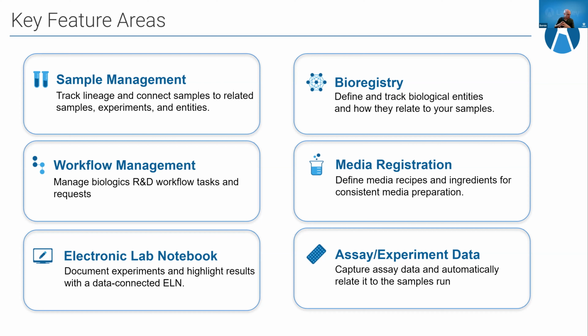I see another question here. For your more production-minded customers, does the Biologics LIMS interface with liquid handlers and automated systems? Can it create work lists and import-export data from the liquid handler based on samples and workflows?